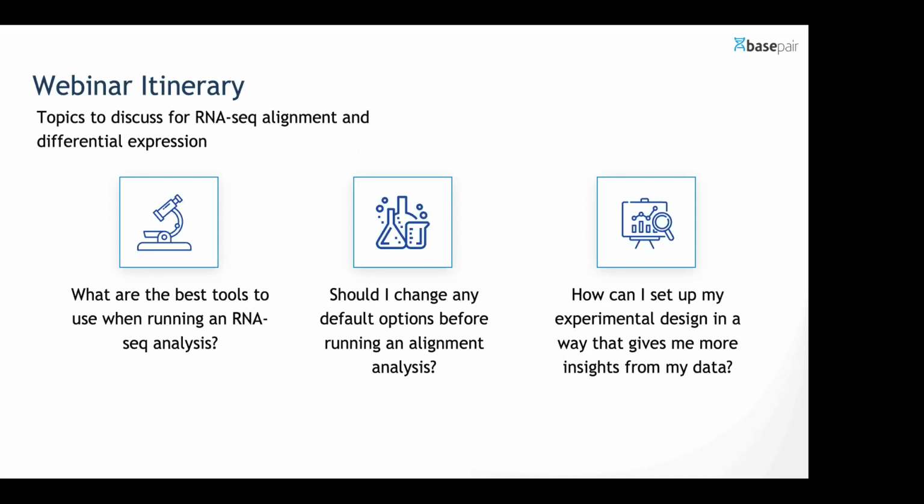And then finally, going to differential expression and how to set up a simple just two-group comparison. And if you have some more complicated experimental designs you want to do, I'll talk a little bit about how you can set that up on base pair.